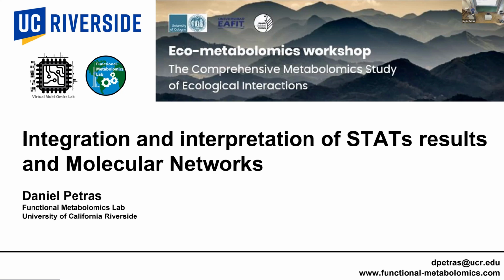Besides the most exciting part, integrating the data yesterday in Cytoscape, we're now going to set an additional layer on top of that, so it becomes even more exciting. We want to integrate some of the statistical results now. While doing that, I also want to take a look at some of the plots with you and interpret the results, what's going on. Then I would encourage you to take some time to explore it by yourself.